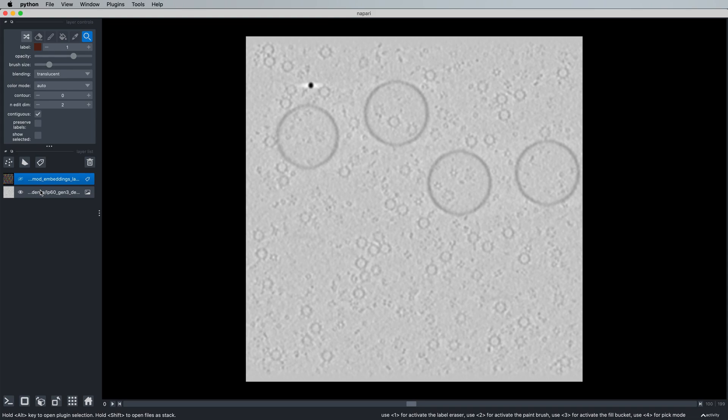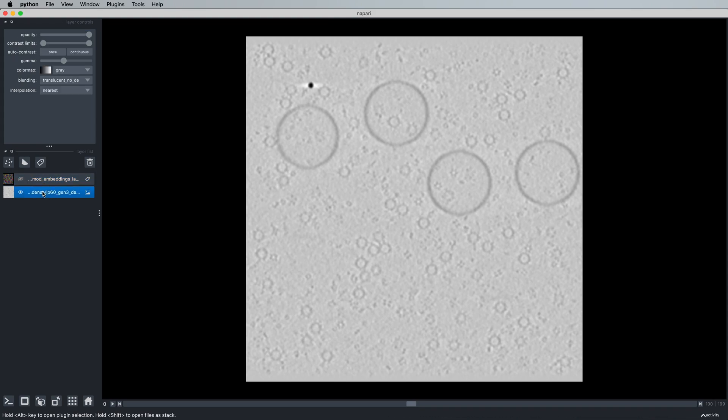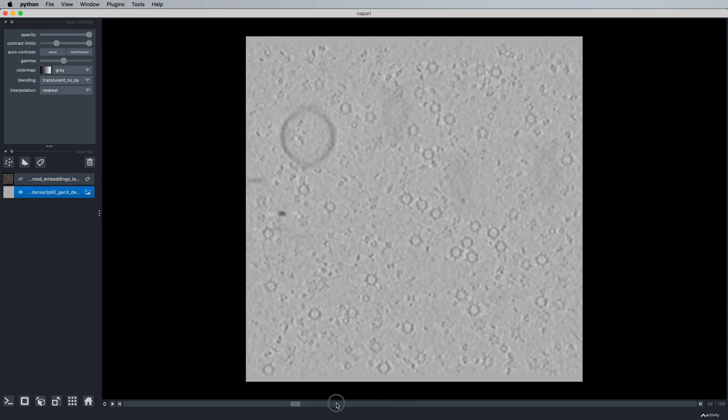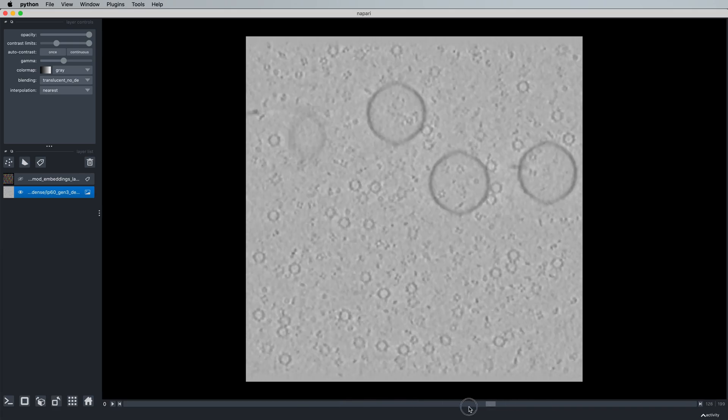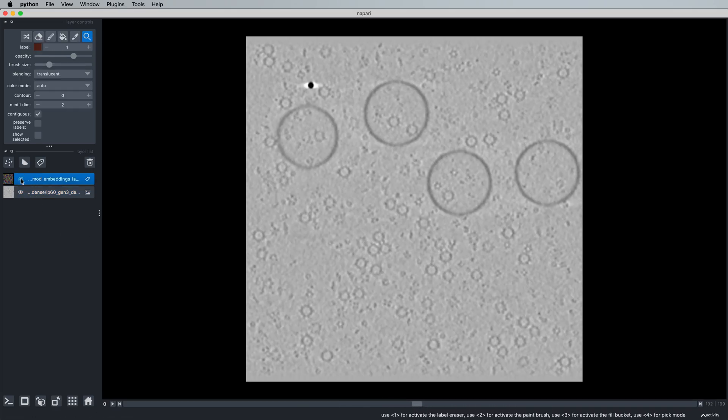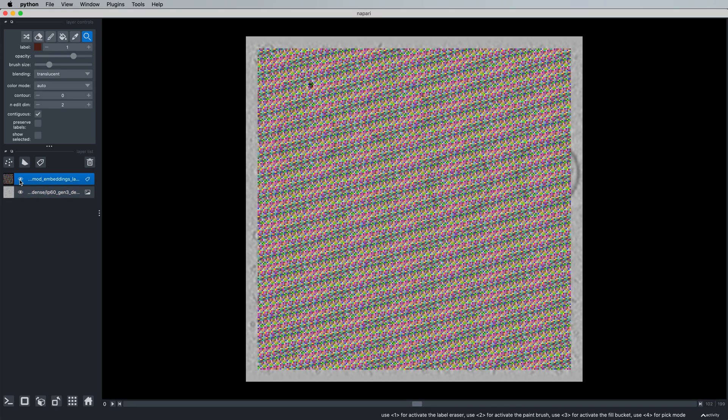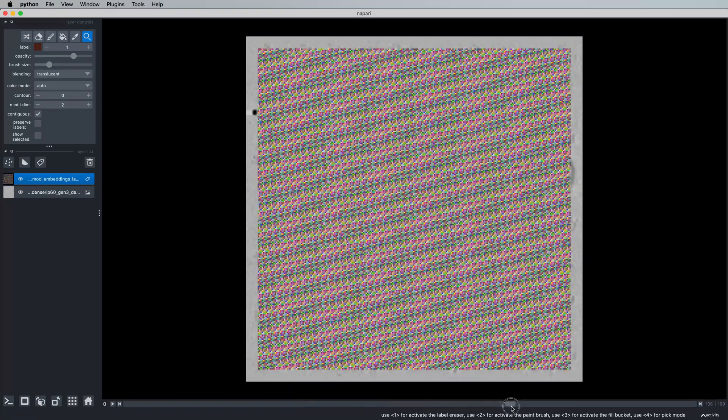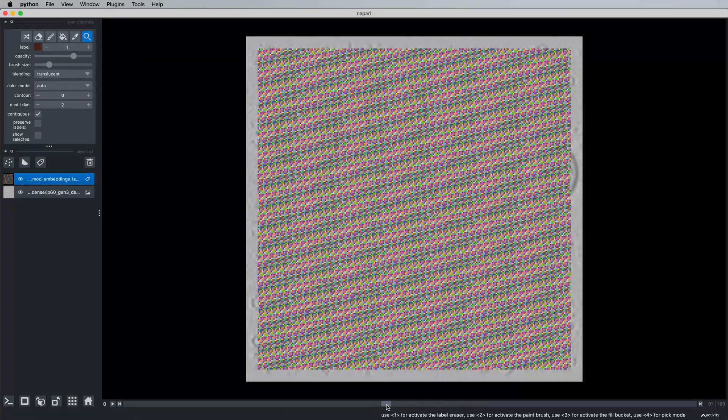To get started, you see that I've opened two files. The first file is our tomogram, and the second file is an embedding mask created with a simple script in TomoTwin that essentially masks out the region of our tomogram for which TomoTwin has created embeddings.